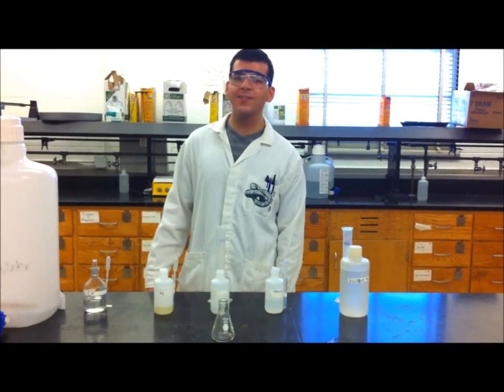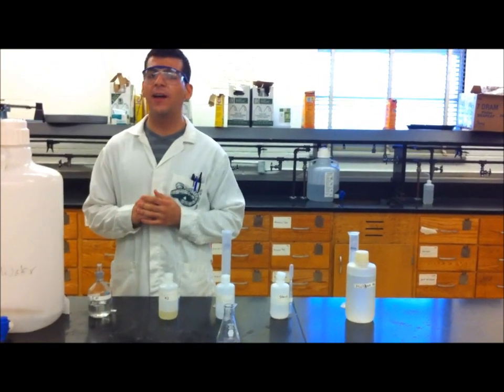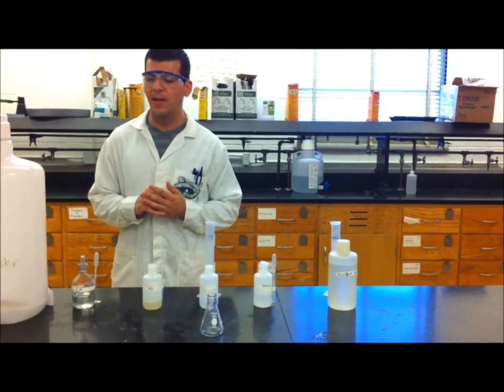Hello, my name is Juan Luis Sanchez. I am a chemistry producer here at Utah and today I will be demonstrating an experiment involving rates called the iodine clock reaction.